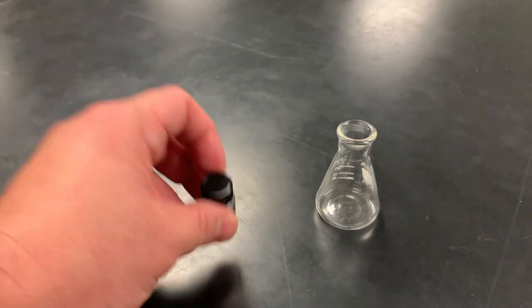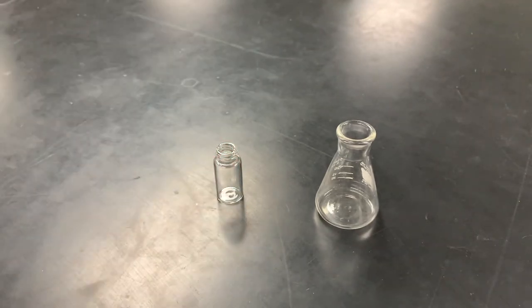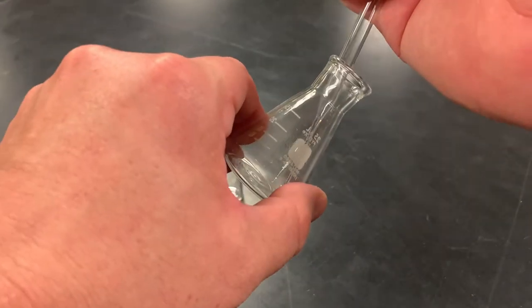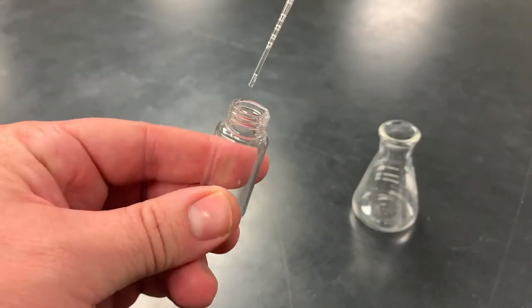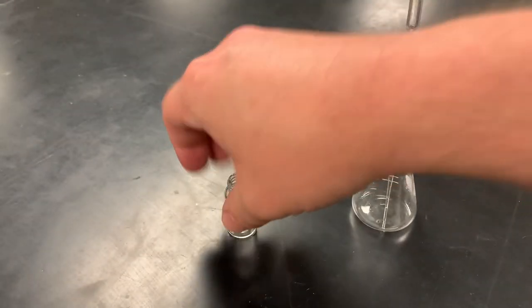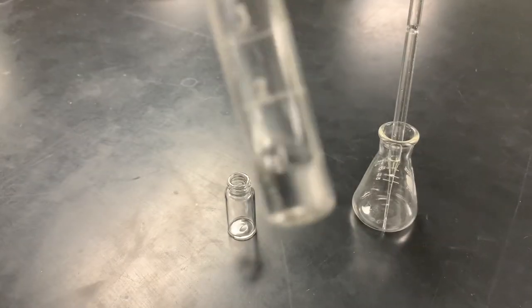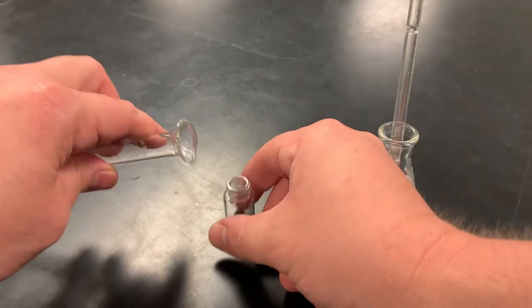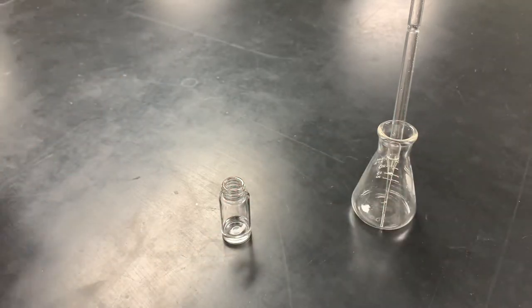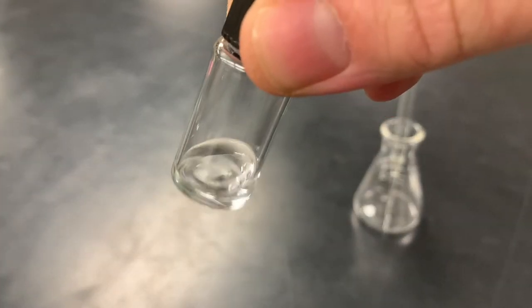So last thing we need to do before the GC is take our compound and a little flask, and we're going to make a GC sample. To make the GC sample, it's literally just one drop of your compound. That's it. I know, that's it. And 1 milliliter of diethyl ether. Cap, swirl to dissolve, and take that to the GC.